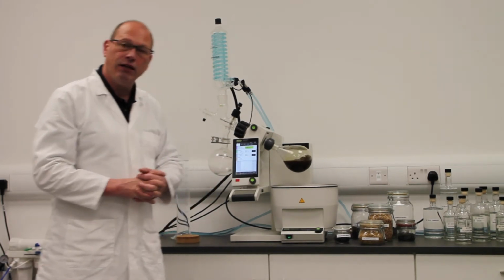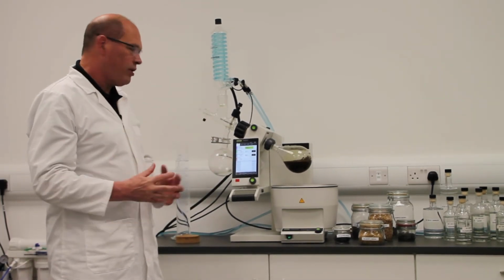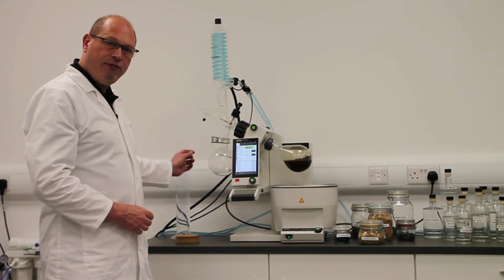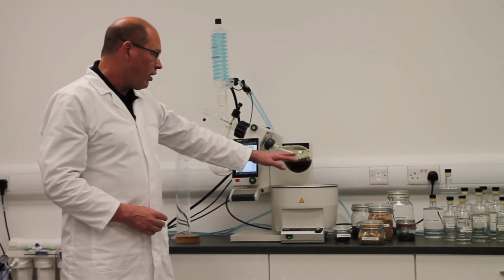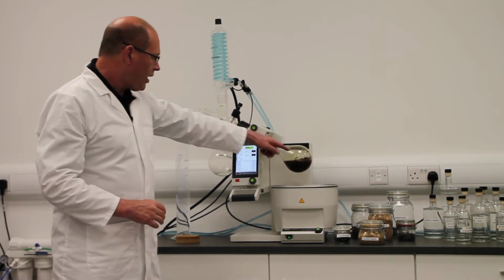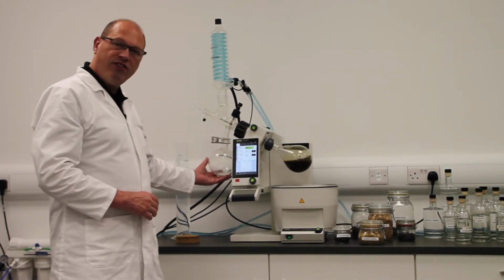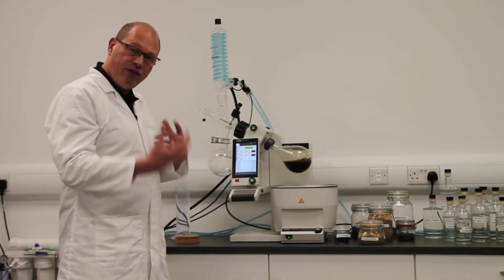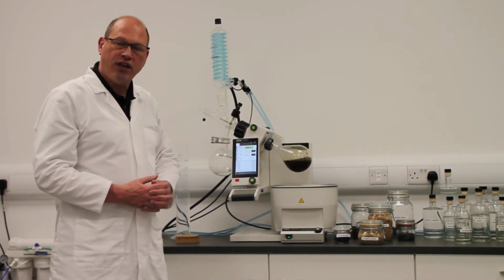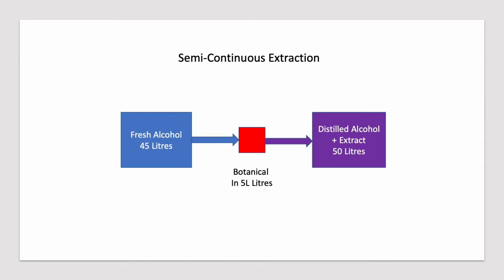And the final excellent use for a rotary evaporator is because this is under vacuum. What you can do is you can feed in fresh solvent, fresh ethanol, into the flask using this tube here. The ethanol goes into here, but at the same time it's distilling out the lovely extract that you've got. So the ethanol and the extract is coming out here when fresh ethanol has been added. And if you look at the schematic on this slide, you can see how that can be used to effectively increase the volume of the flask, of the still, by this semi-continuous distillation process.